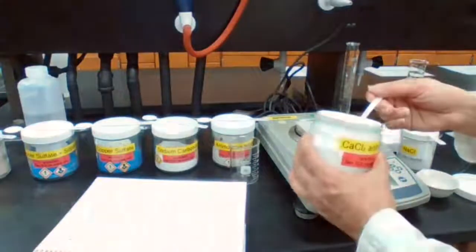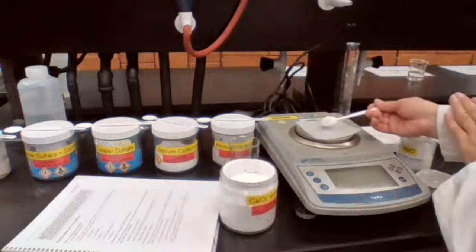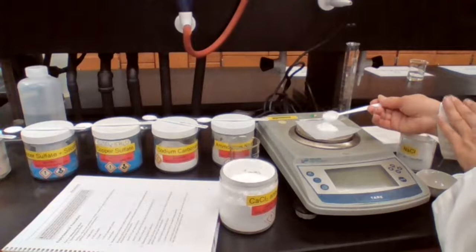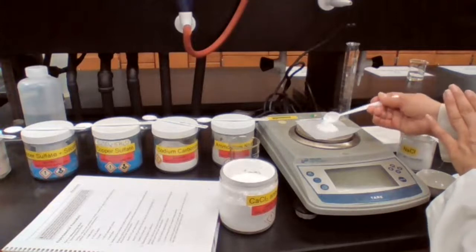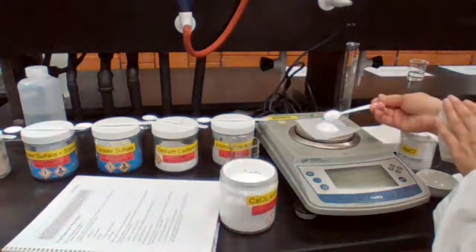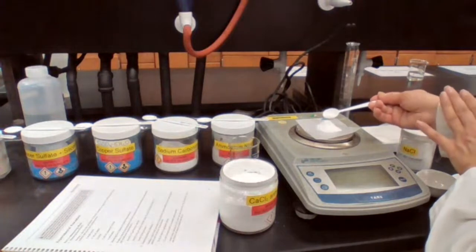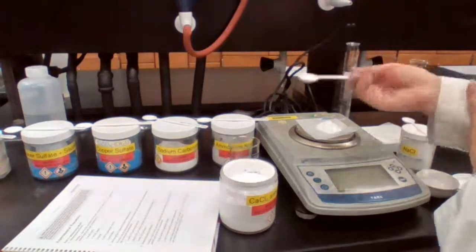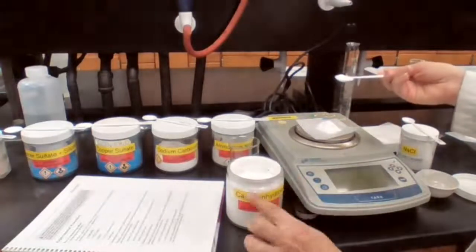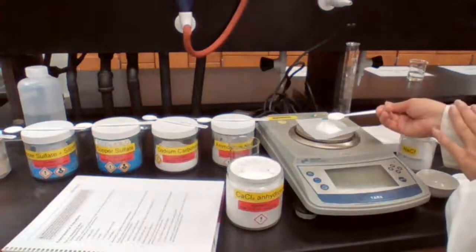Anhydrous compounds, it means that they can absorb water. They are not hydrated, but they are good absorbents of moisture and water. If you leave it out for a while, it's going to actually absorb the moisture from the lab environment, and it can gain mass. So when you are dealing with anhydrous compounds, or anytime you see a container with the word anhydrous on it, you want to make sure to close the container right away.